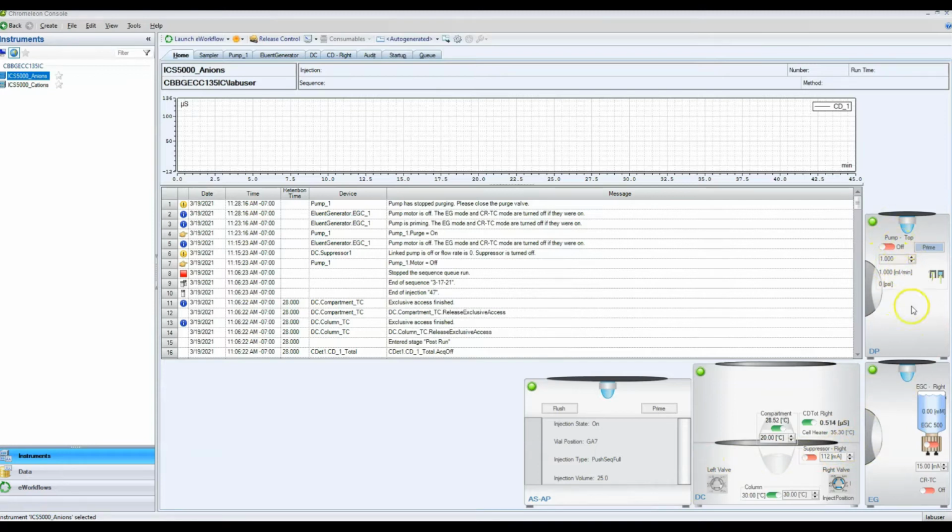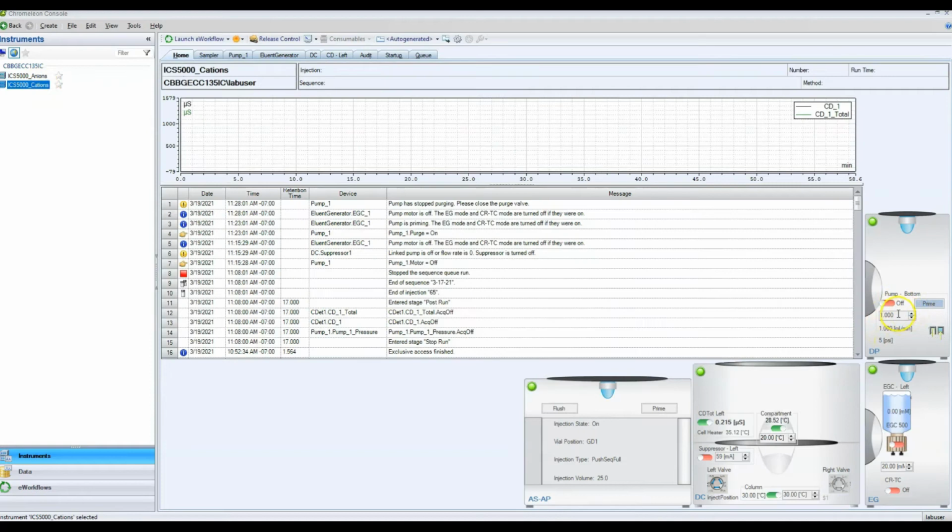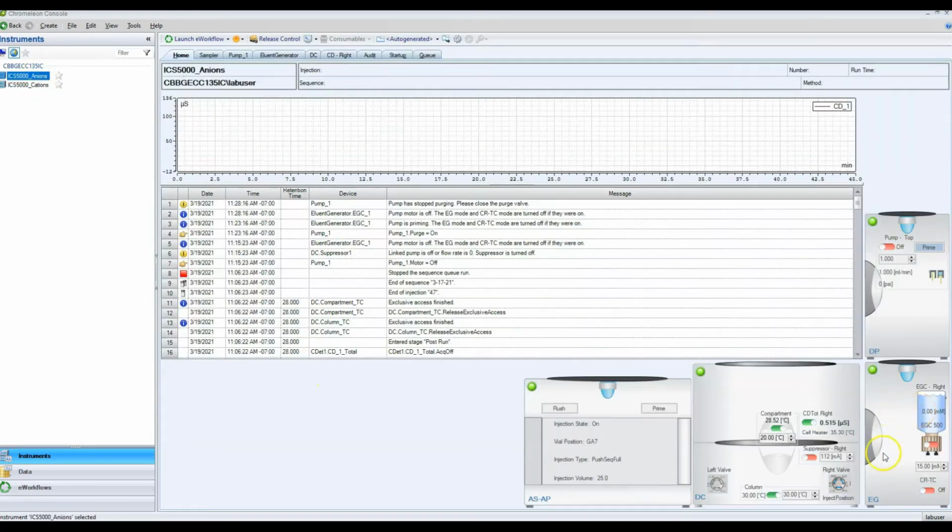Remember when we opened that purge valve? And then the cation side, the pump is actually here on the bottom, like when we opened the cation purge valve. Also, this is down here where the eluent generator cartridges sit, and this is where our columns sit. And this is called the TC compartment because it is temperature controlled. If you only want to run one type of analysis, you only need to mess with one of these sides. But if you want to run both, you do need to get both of them ready to run.